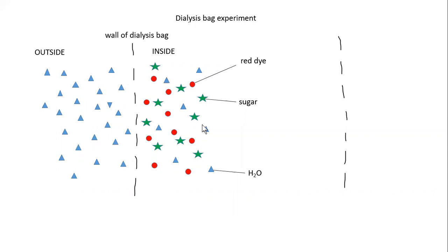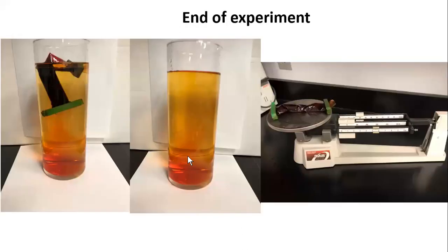Now, we cannot visually observe the water molecules inside the bag, but because water molecules are trapped inside the bag, we can weigh the bag and ask the question, was there any water trapped inside the bag? Did the weight of the bag increase at the end of this experiment? And you have to take my word for it. Those of you who observe this in live, they can attest to that indeed the weight of the dialysis bag increased.